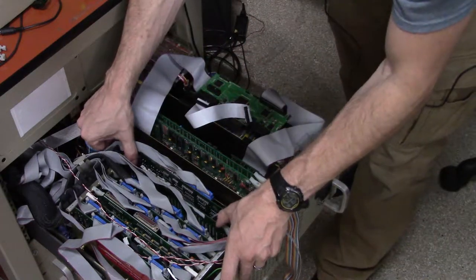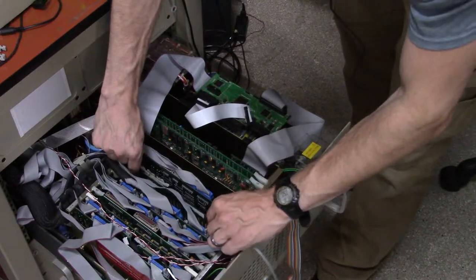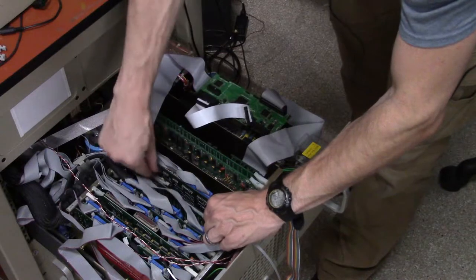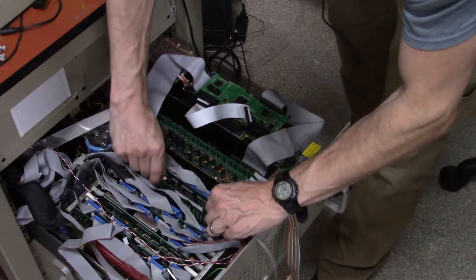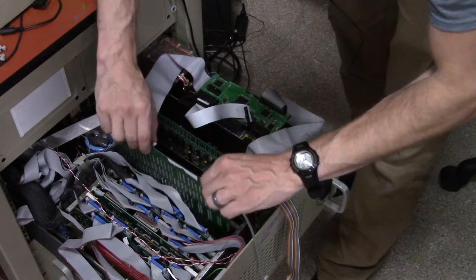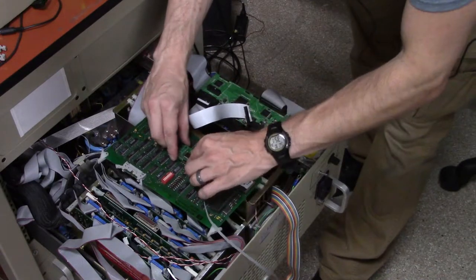Very carefully, pull on the a2 motion board and try to warp it a little bit so there is more space for it to go up. Very carefully take it out — and here it is. Now you can take it off.